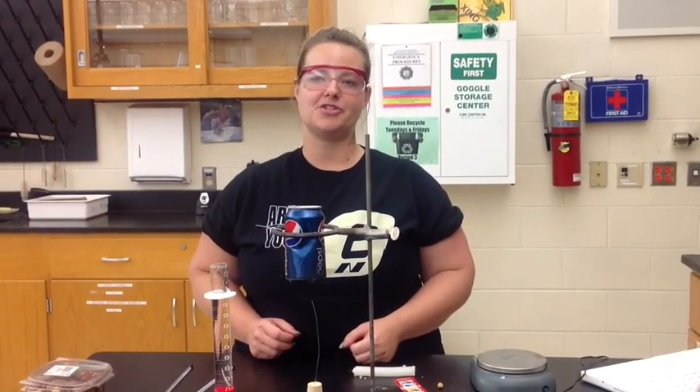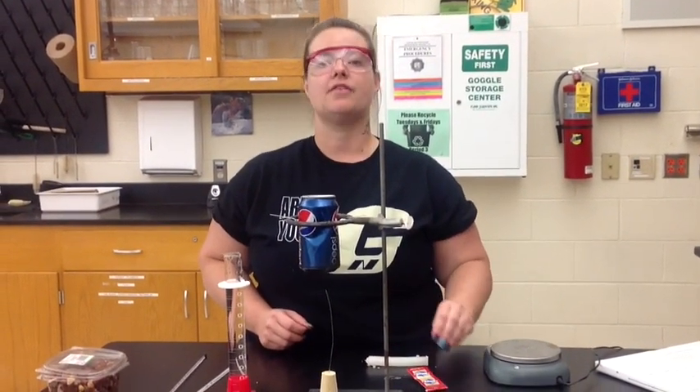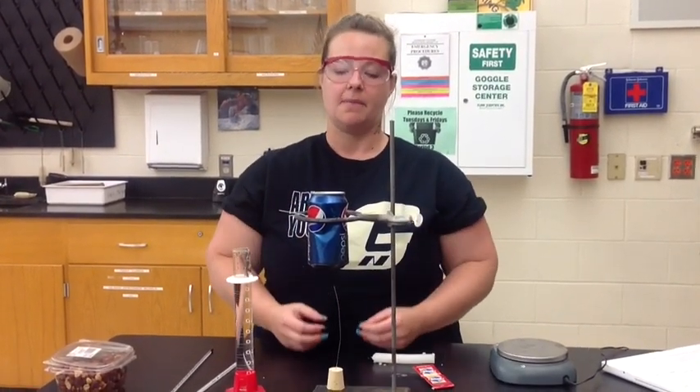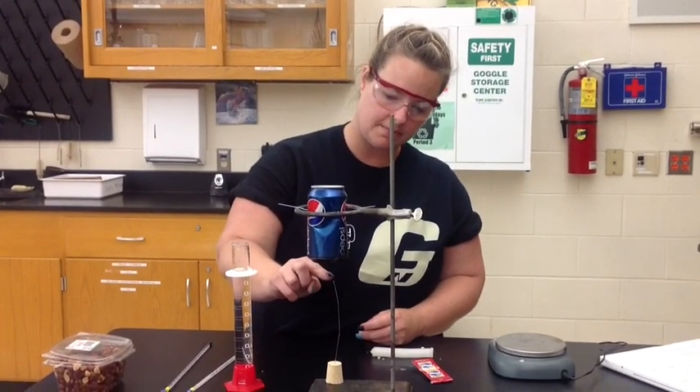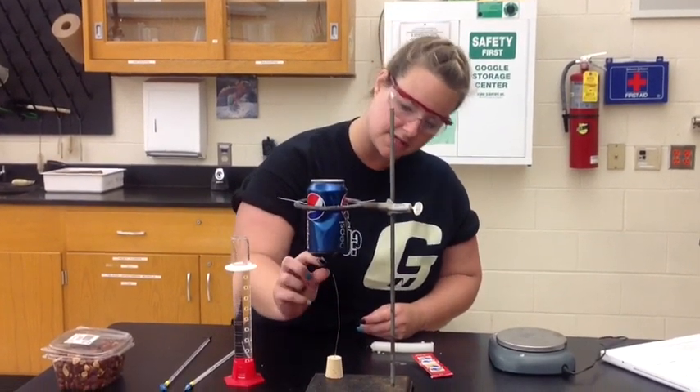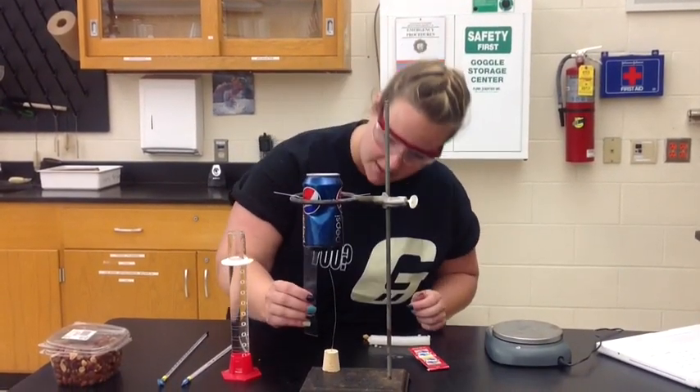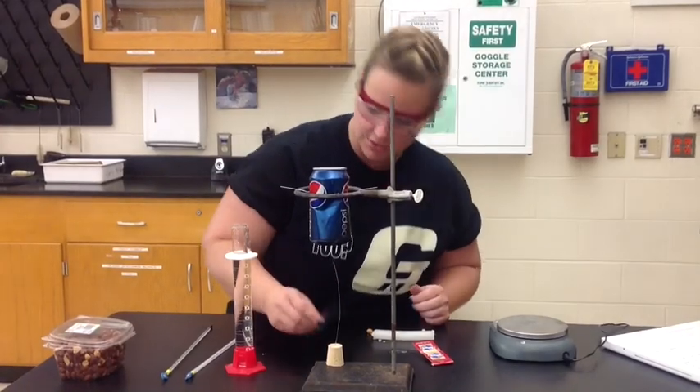I'm going to be conducting the calorimetry lab with a peanut. The first thing you need to do is read through your lab and then make sure that your setup looks like mine does here. Make sure also that your stick for the food source is measured out as being only 3 centimeters away from the base of your can, so make sure to measure that.